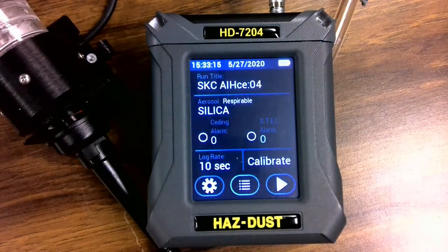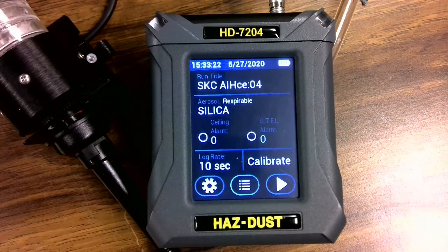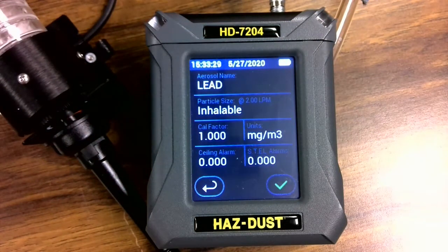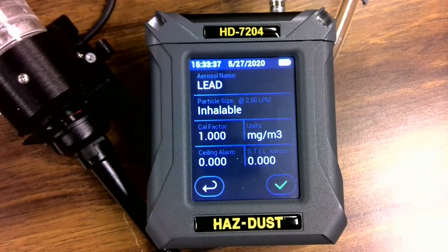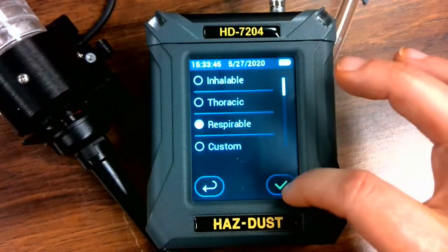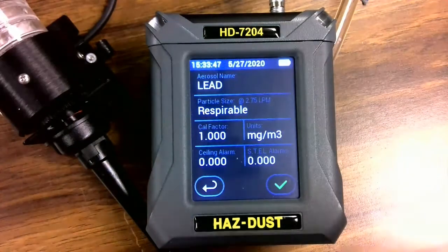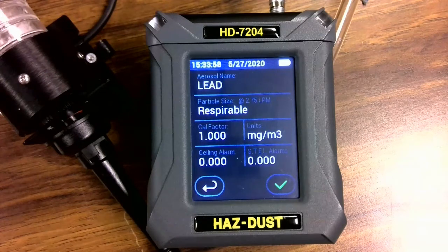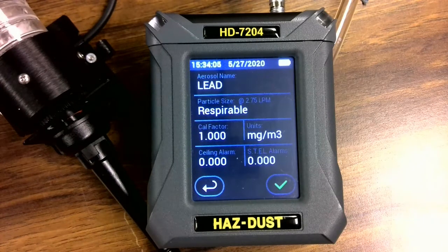Next is the aerosol library. The aerosol library is where users can select respirable, inhalable, or thoracic-sized fraction. Because the HD7204 is equipped with a flow-compensated pump, the flow will automatically adjust according to your selection. I have here selected inhalable, and it will show two liters per minute. I can change this to respirable, and you'll see it changes to 2.75 liters per minute. The aerosol library is also where users can create unique cross-calibration factors. Stay tuned for more videos in which I explain how to verify the flow using SKC's Checkmate and also a more detailed discussion on calibration factors.